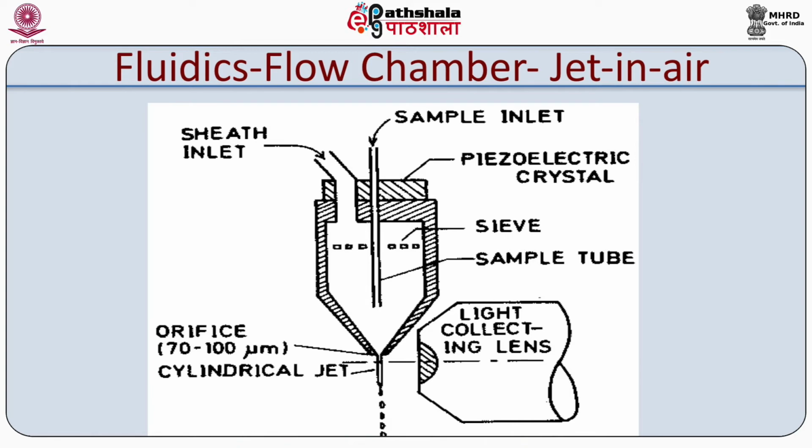The laser beam is focused through an achromatic lens to intercept the fluid stream at an optimal angle and position after the stream exits the nozzle. Because of variations in focusing and in the position of the stream, the alignment of this cytometer is less stable than that of a benchtop analyzer and needs to be optimized on a regular basis.